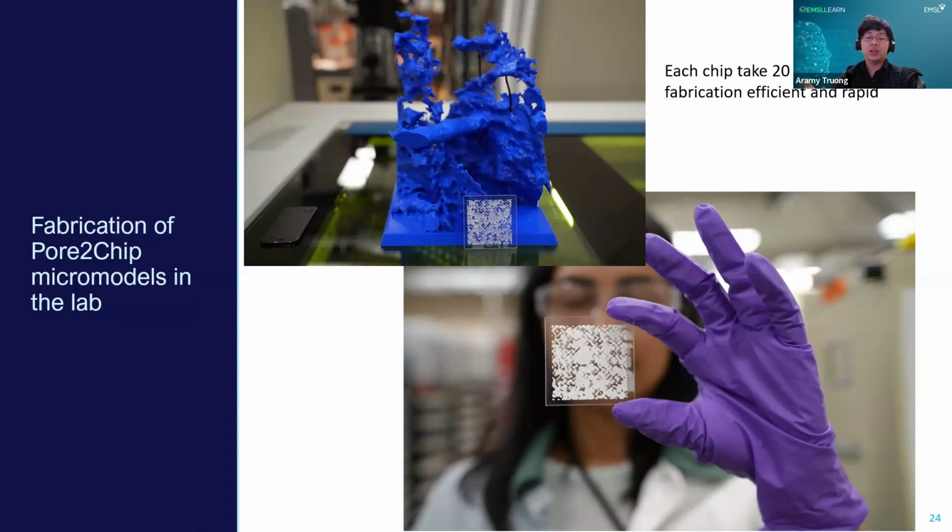And one thing to mention is that in these images, we etch them on acrylic glass, but most likely we'll be making micromodels on epoxy resin slides, which I'm going to talk about now in a second.